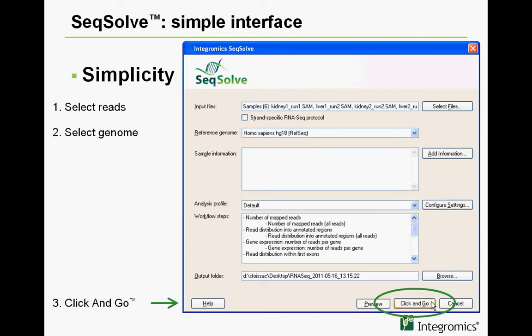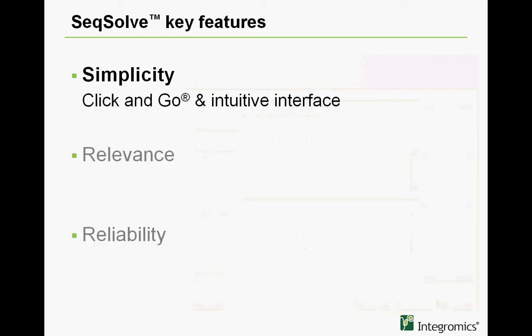SeqSolve features the click-and-go system, which triggers the automatic processing of your data. With click-and-go, no need to be a computational expert. The full RNA-seq workflow is performed and all the results are automatically generated. This is how simple it is to use SeqSolve.